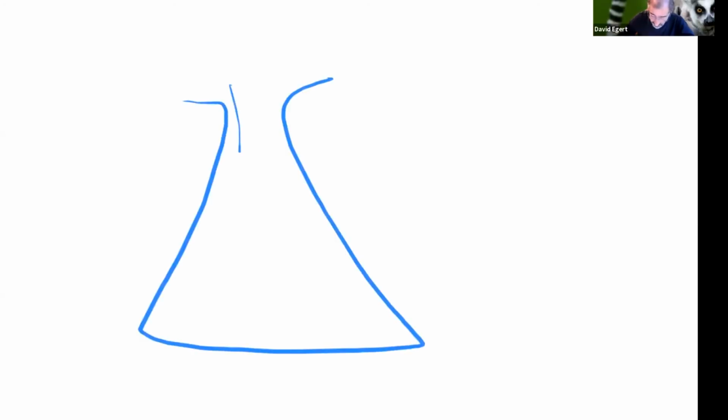Anybody? Maybe so we're keeping the amount of solution the same, but we're just changing the concentration. Exactly, right?